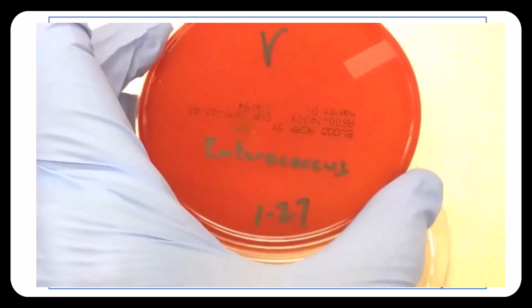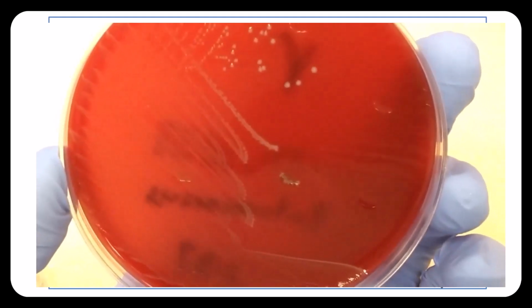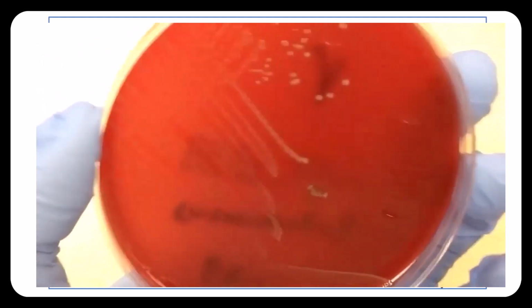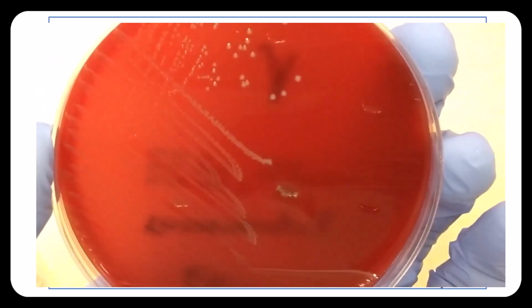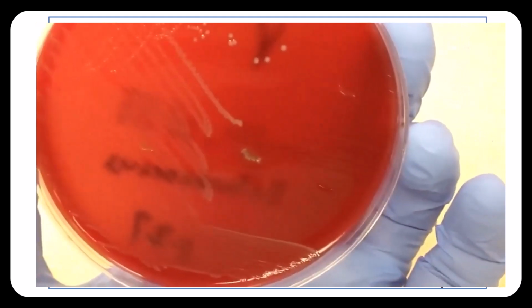The third type is gamma hemolysis, which includes enterococci. You can see the growth of the bacteria on a plate after 24 hours of incubation with increased CO2, but there is no zone around the colony. You can see the colony, there is no zone around it, which indicates gamma hemolysis. This is all about the three types of hemolysis.